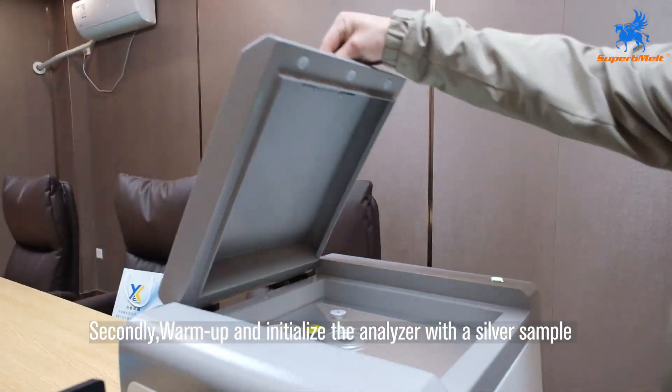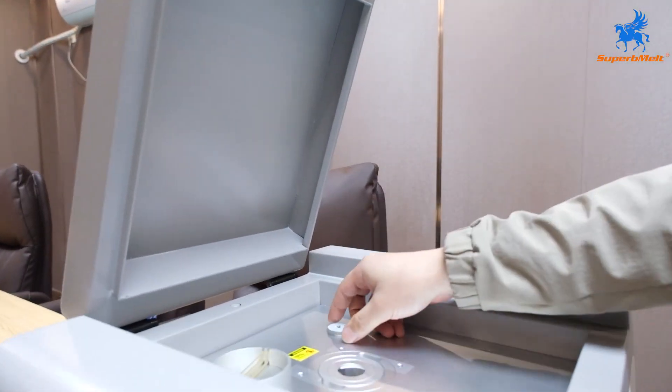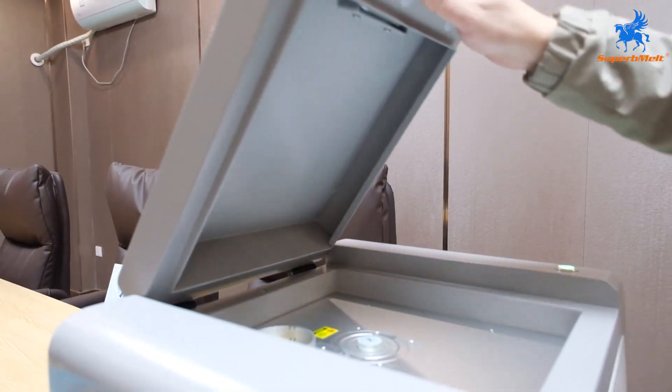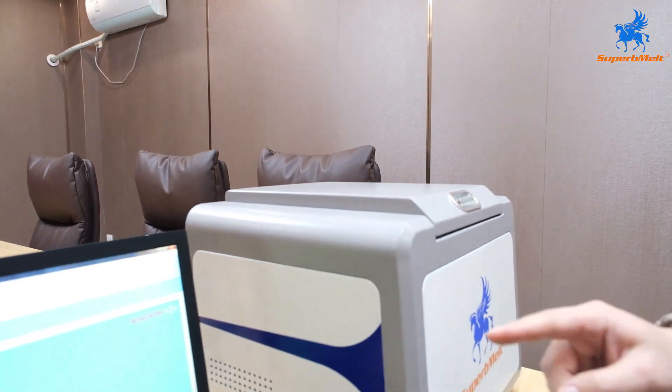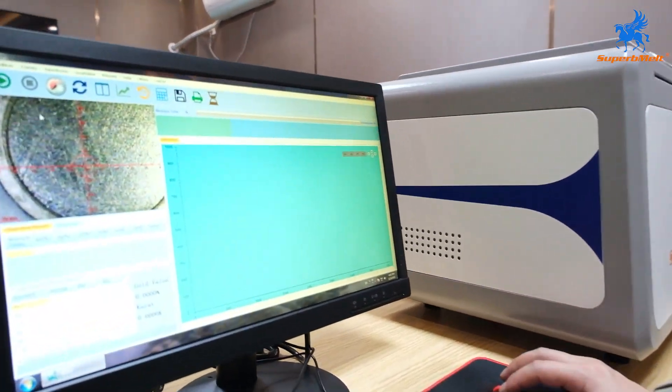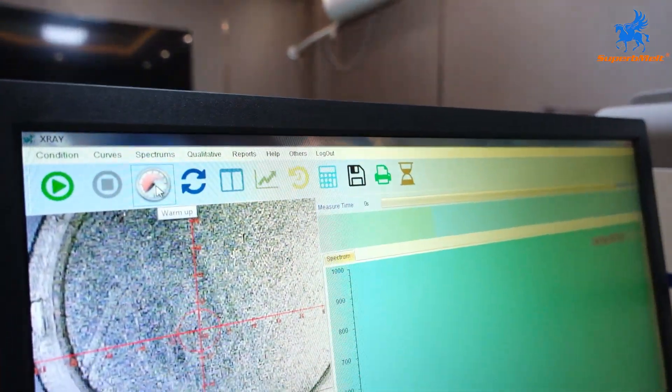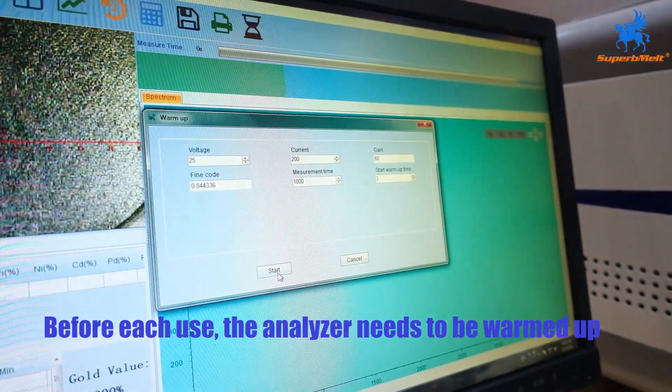Secondly, warm up and initialize the analyzer with a silver sample. Before each use, the analyzer needs to be warmed up.